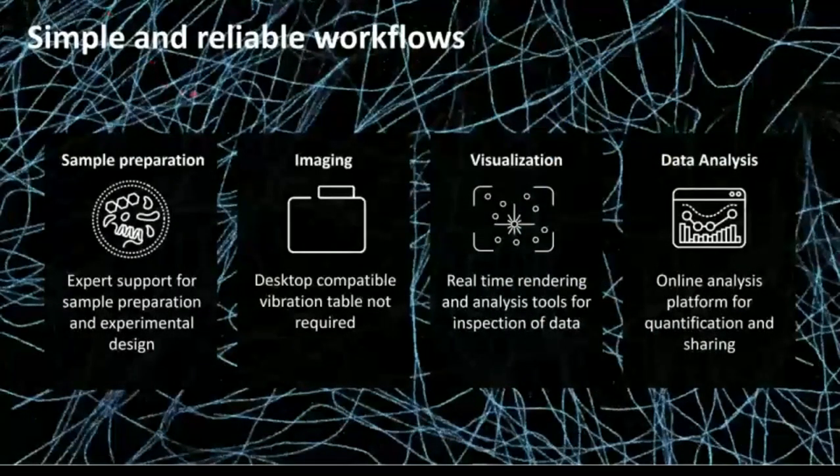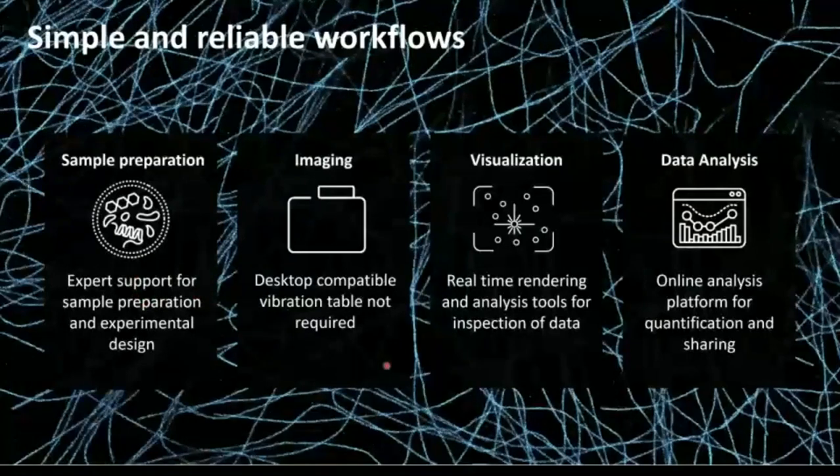So the Nanoimager and us at ONI, we provide simple and reliable workflows. We have expert support for sample preparation, experimental design. We provide a desktop-compatible Nanoimager that does not require a vibration table. We provide real-time rendering analysis tools for inspection of the data. And we provide CODI for online analysis and for sharing our data across the globe.